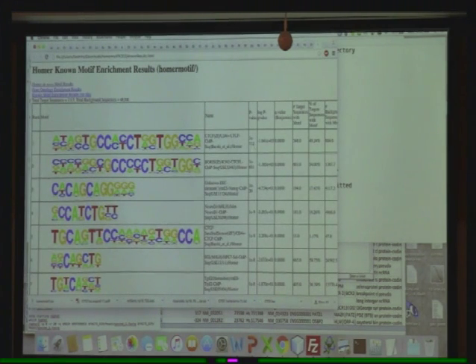You'll see the top ranked motif is CTCF. I've run it through a couple other things, and it gives you the motif. If you ever present this, you'd show this logo and say that's the motif for CTCF, it called it, and here's the p-value. Therefore, this is likely CTCF.